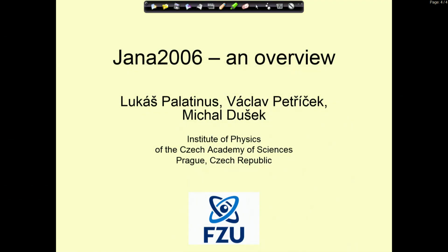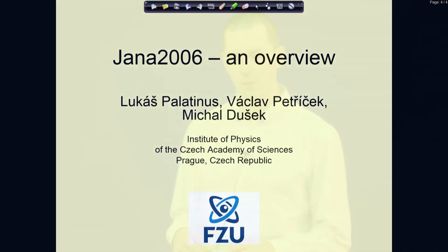Hello. We'll continue the workshop with the second lecture with the title Jana 2006, an overview. This lecture will be quite different from the first one, and also different from the rest of the lectures in this workshop. It's not a tutorial lecture, it's more, as the title says, an overview of the program Jana 2006 that we will be using for this workshop in the practical sessions.